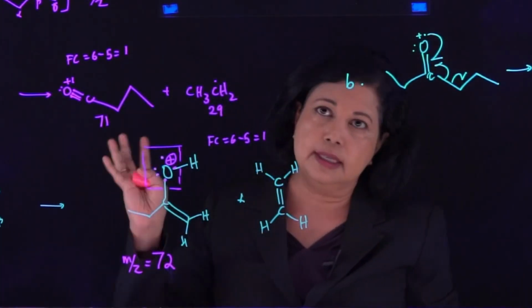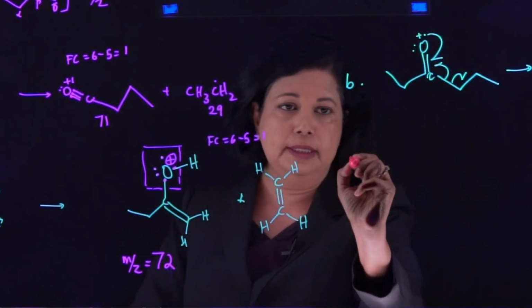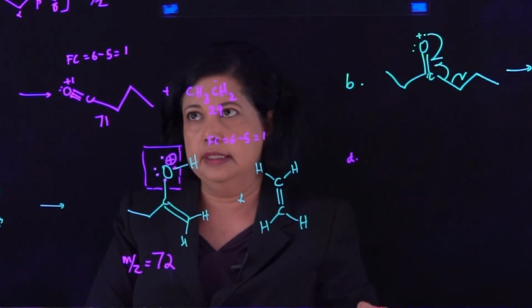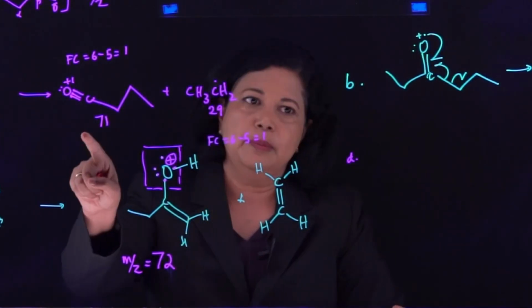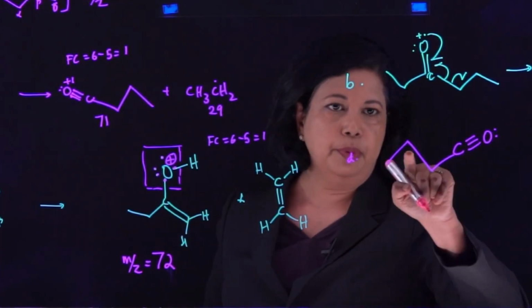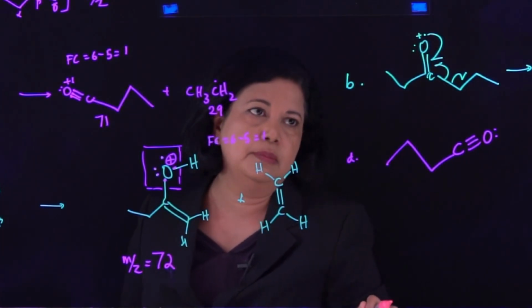And carbon monoxide is one of the biggest, we call it a silent killer because it can be there and it can work on your lungs and kill you, right? So let's go from 71 here. 71 is your carbon monoxide attached to a propyl carbon. So that is a possibility for this molecule.